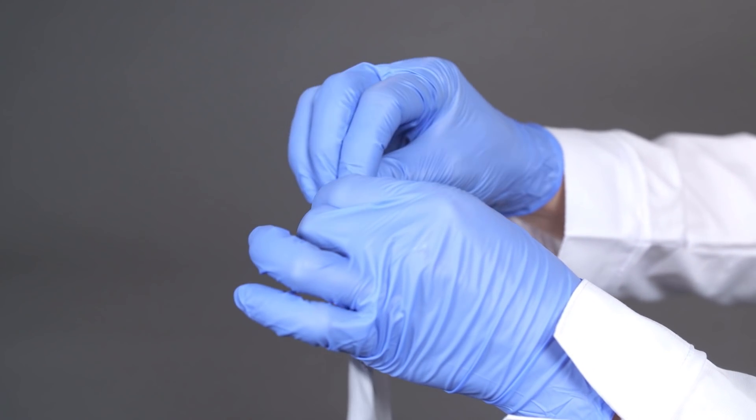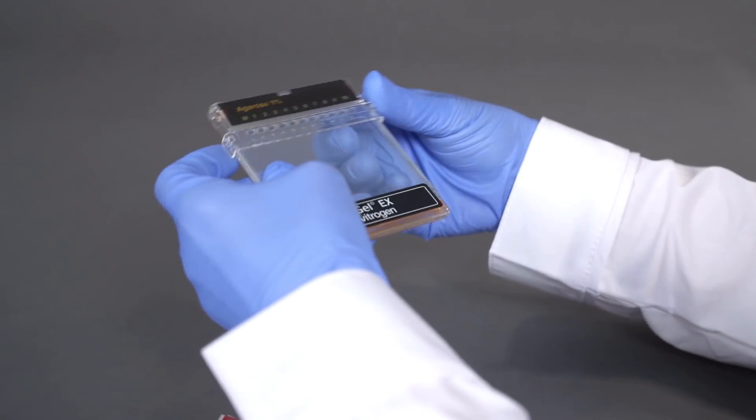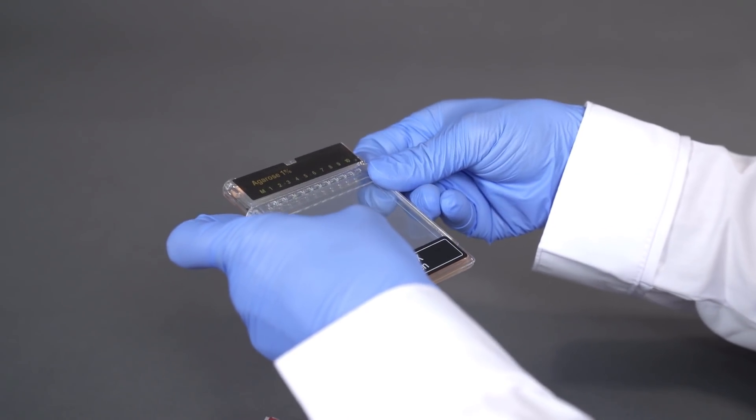We will now demonstrate how to perform an eGel EX agarose gel run. To begin, remove the eGel cassette from the package and remove the comb.